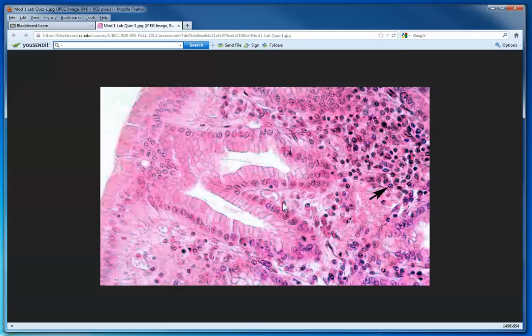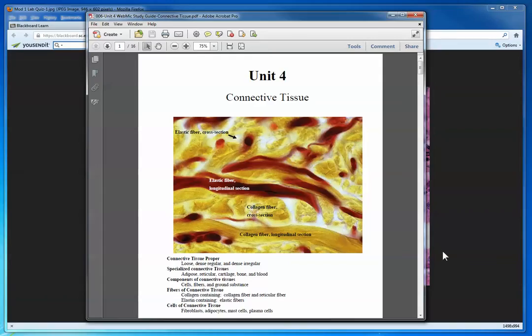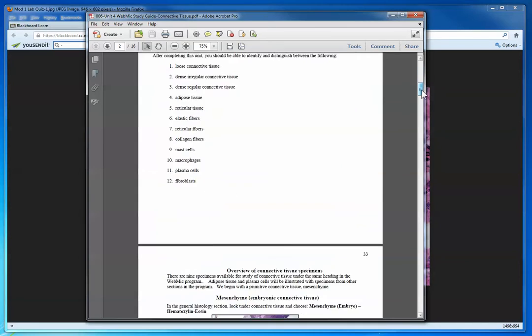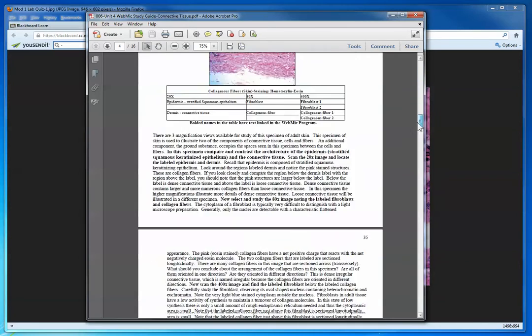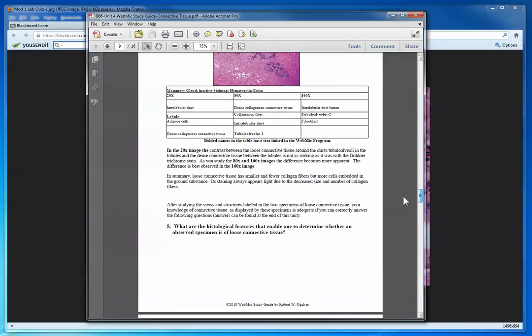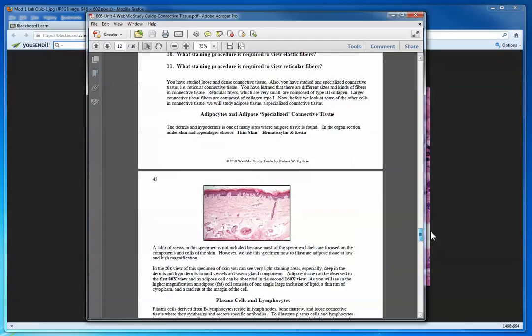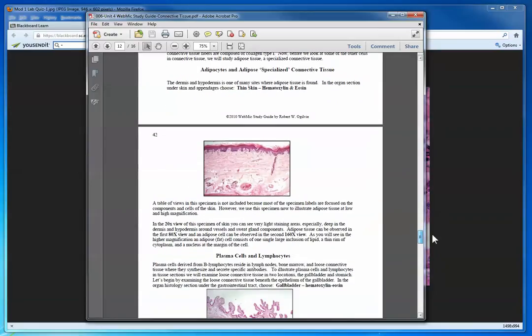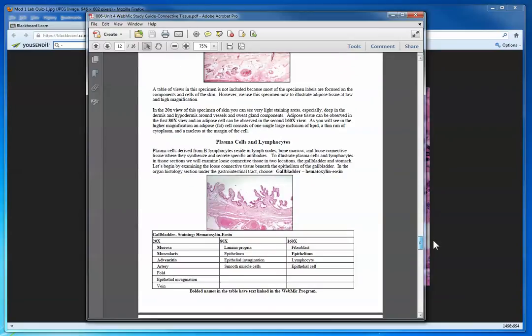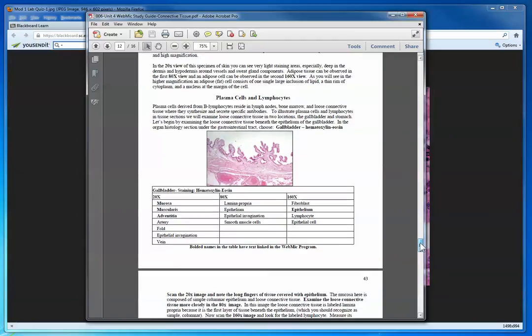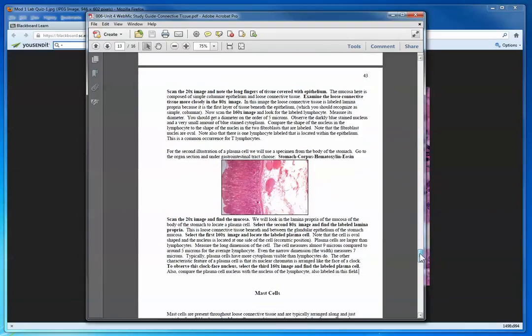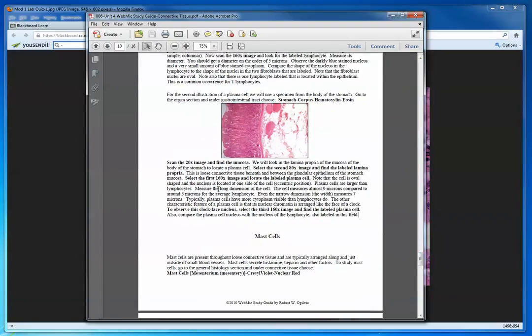I'm going to now bring in some of the resources that you are instructed with in WebMic. In the WebMic study guide, unit four connective tissue, you learn about the different types of tissue and then you learn about the cell types. If I scroll down here to page 43 or thereabouts, we begin plasma cells and lymphocytes. I'm just going to tell you now that that's a plasma cell. How would you have learned about the plasma cell? This is the place you would learn something about it. Here we have your direction to go to stomach corpus hematoxylin eosin.